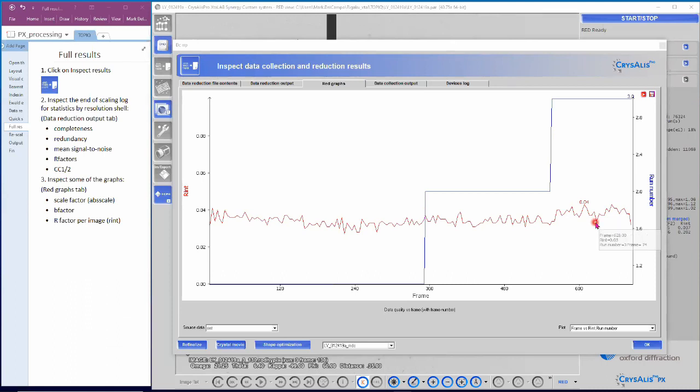If you see anything alarming or an outlier while you're looking through these plots, just make note of it, and you can use a filter later in rescaling to eliminate it. For example, if in this rint plot I saw one particular frame that had an rint of, let's say, something outrageous like the number 1, I'd keep that in mind and could choose to filter it out afterwards. I'll show you that in rescaling, which is what we're going to do next.